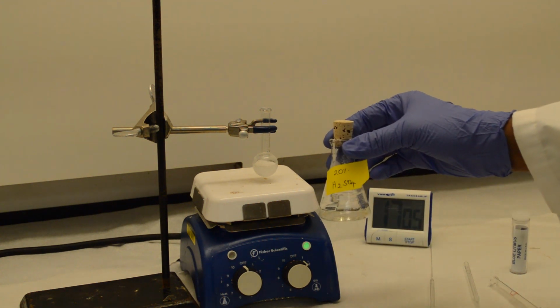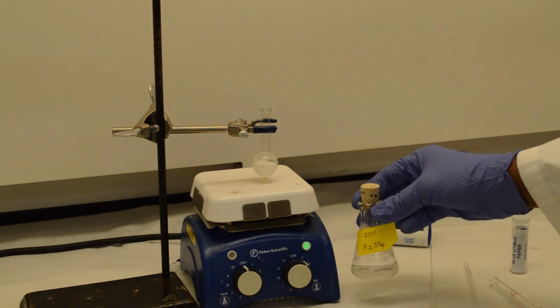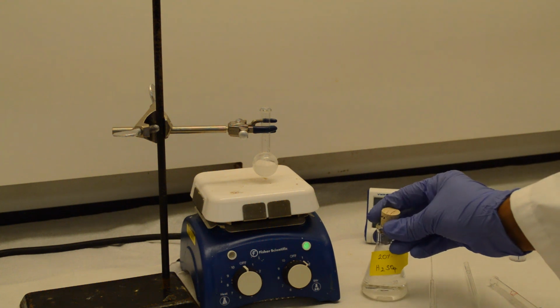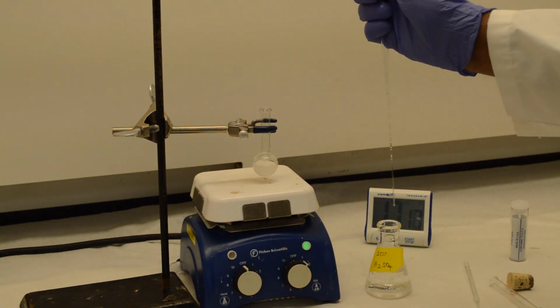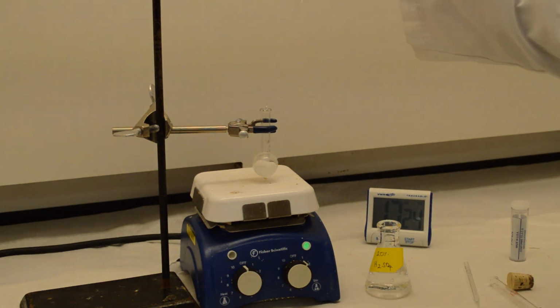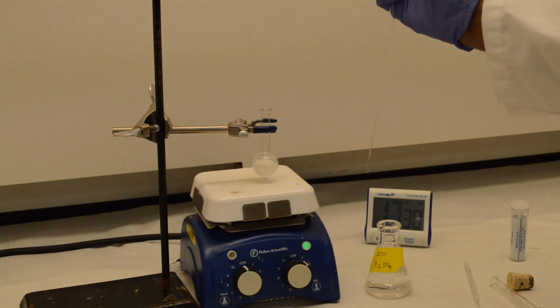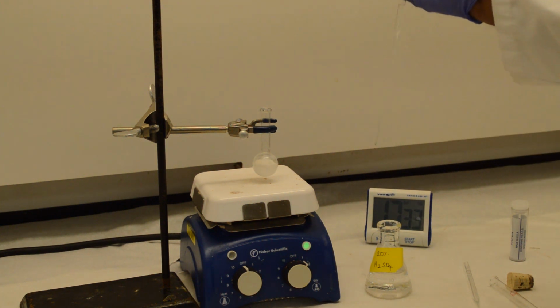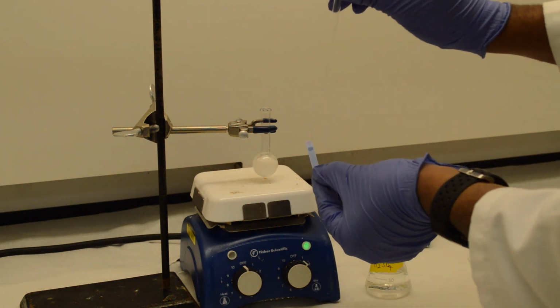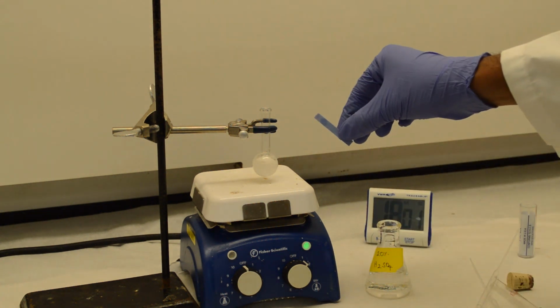Now add the dilute sulfuric acid, the 20% sulfuric acid, until the reaction mixture turns acidic. It's still not acidic.